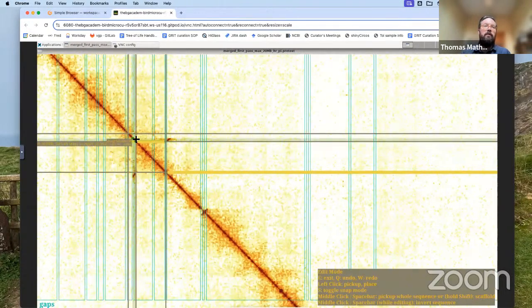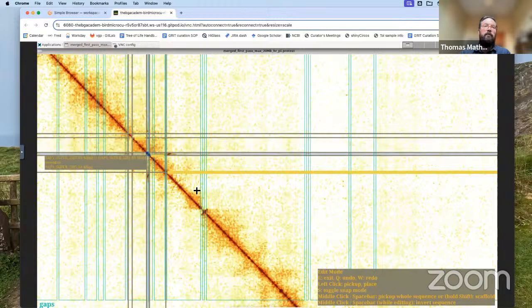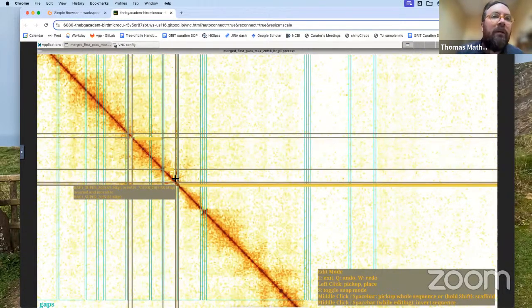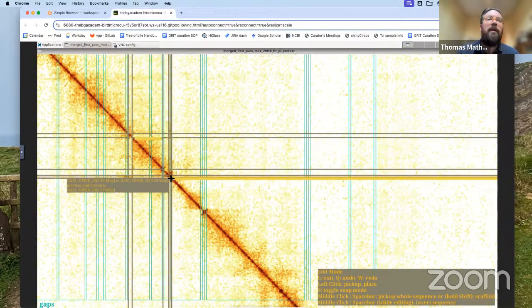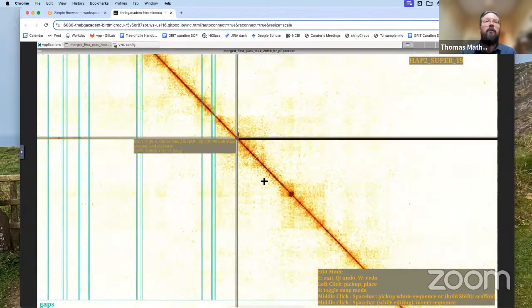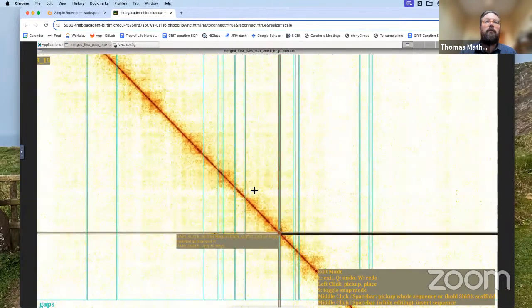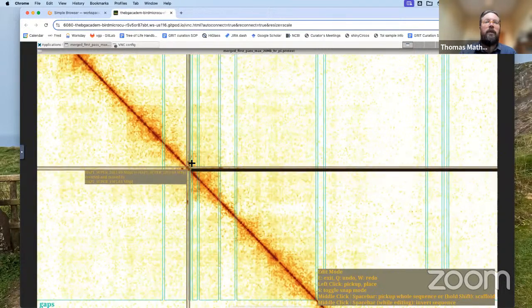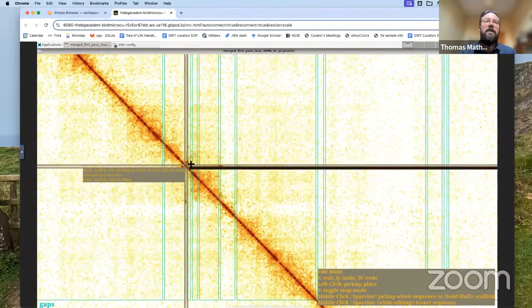What I would do is pick it up. Now you can see that it's present here. If you zoom in, there's parallel lines to this part of the assembly, and let's find it in here. It looks like it also is fat, so it looks like it's actually split.